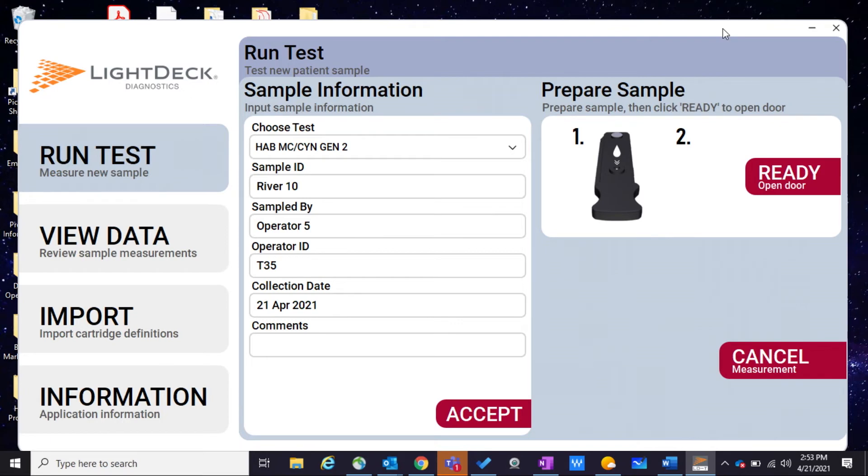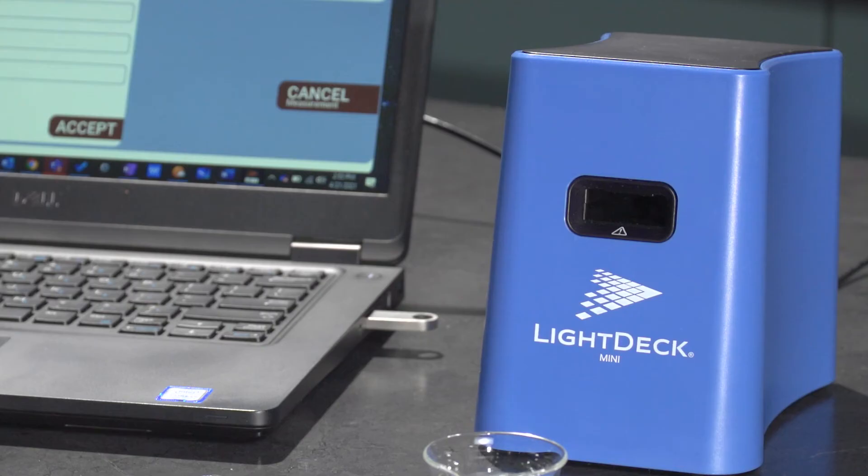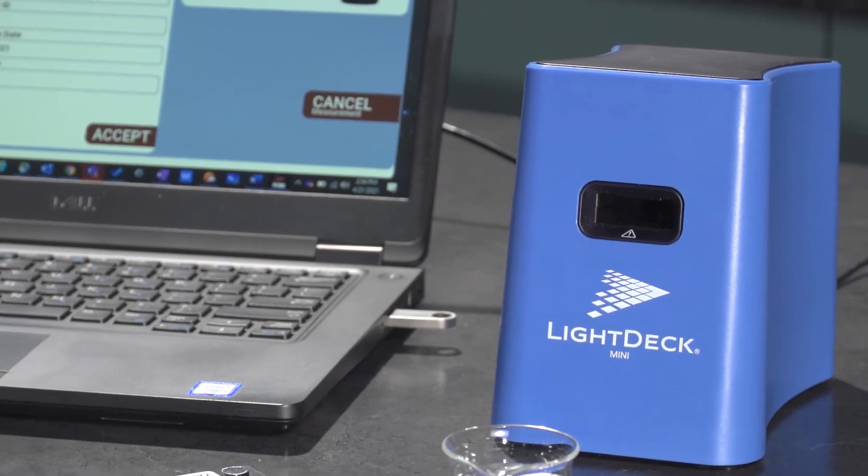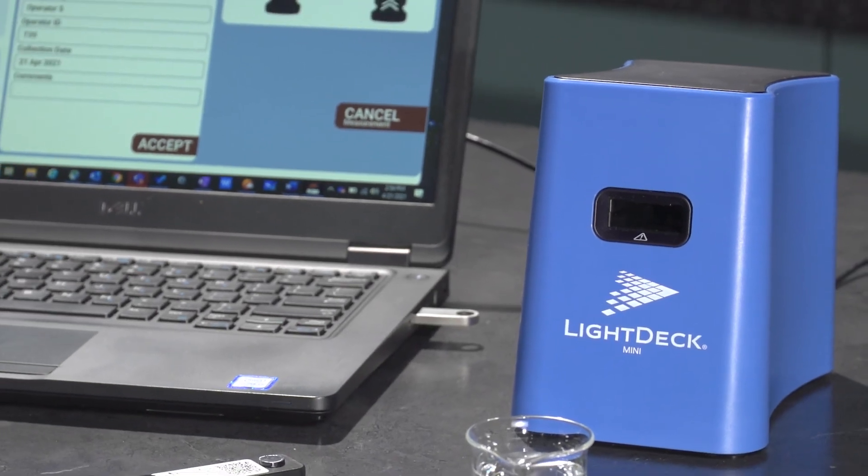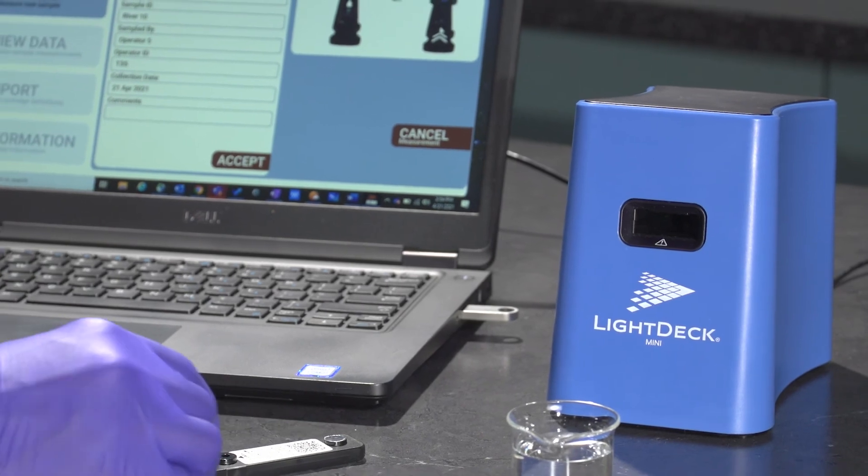Return to the LightDeck application in which you've already input your sample information and click the button labeled ready to open the door on the analyzer. The door will remain open for 30 seconds. Once the analyzer door is opened, insert the cartridge into the LightDeck Mini. If the door closes before the cartridge has been inserted, click the ready button again to reopen the door.